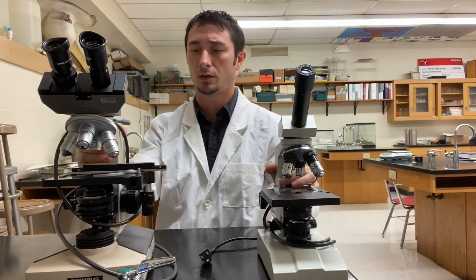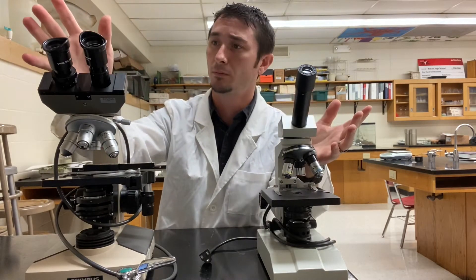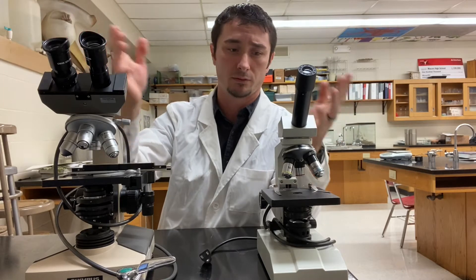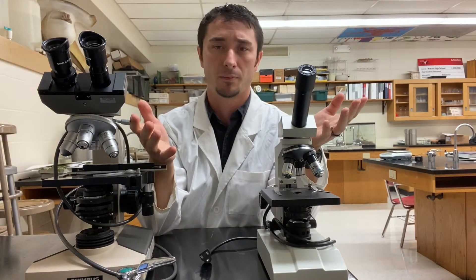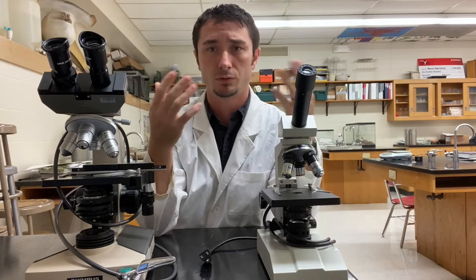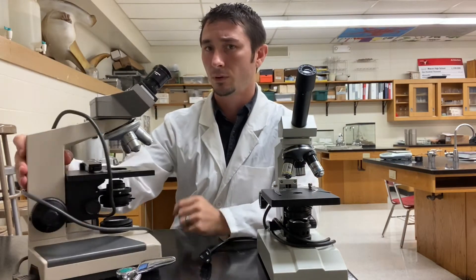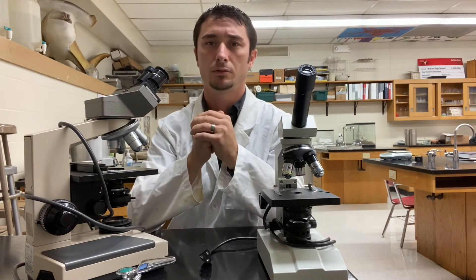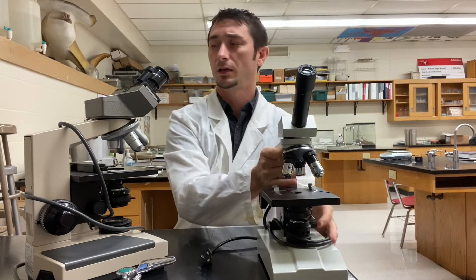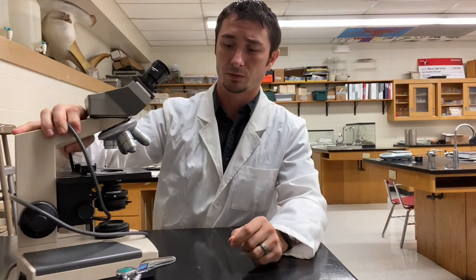We have two different types of microscopes in the classroom: the binocular and the monocular. Mono meaning one, bi meaning two. They both work exactly the same and magnify things the same amount of power. The only difference is whether you use two eyes or one eye. Some people still don't like using both eyes, so the binocular can still be used as a monocular. For today's purposes we're going to look at the binocular one, because the majority of the microscopes here are binocular.